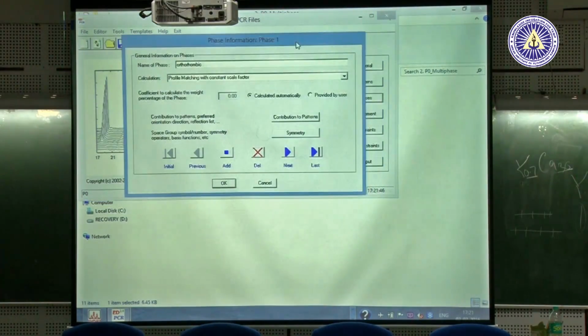As the users told, I have a 2-phase, 3-phase, multi-phase. Then first clicking one time, it will appear singly. I put the orthorhombic structure YCrO3. Basically, it's a synchrotron high pressure study, and it has a YCrO3 material, tungsten, gold.